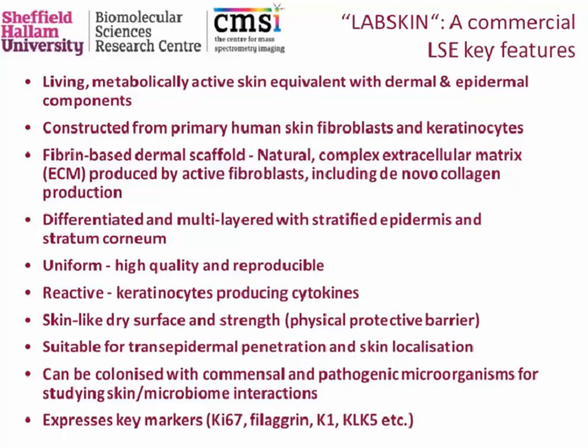So what's nice is, for a 3D model like this, that we can create this air-liquid interface. So we do have a dry surface on the top. So we do have something that is sort of like a stratum corneum, so it is a barrier. We can use it to do drug penetration, and it can be colonized with bacteria. And it does express some of the key protein markers that you would expect to find in human skin.